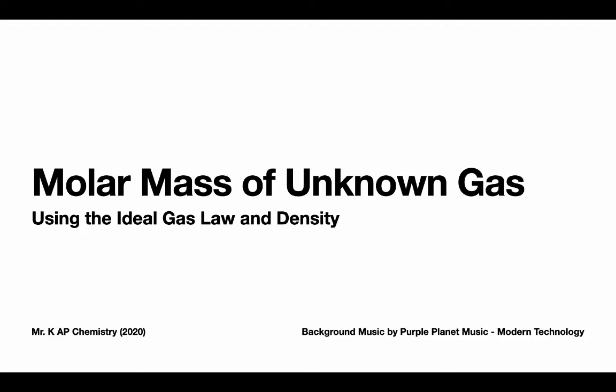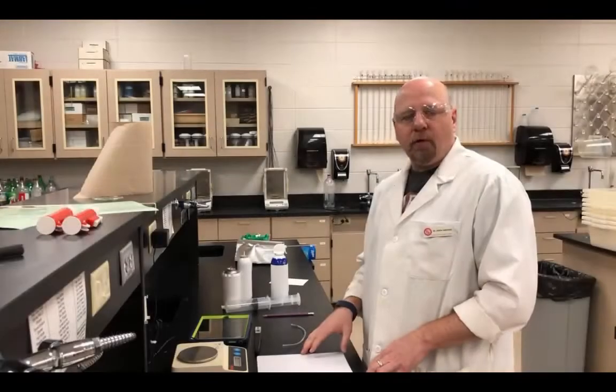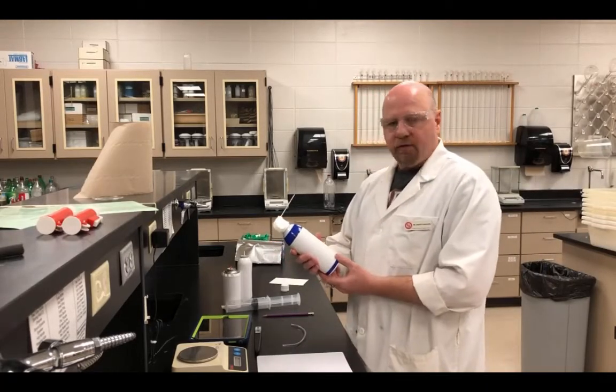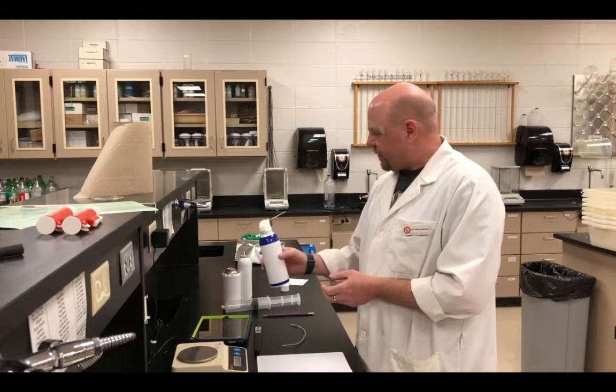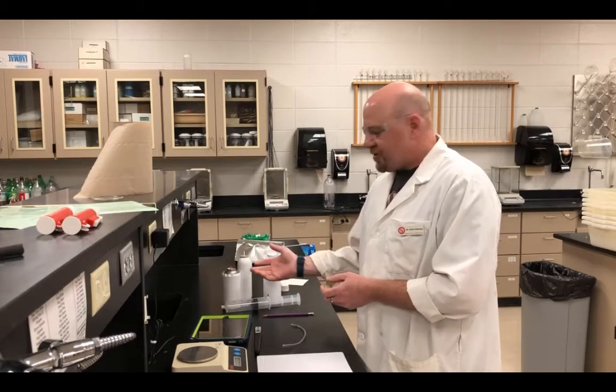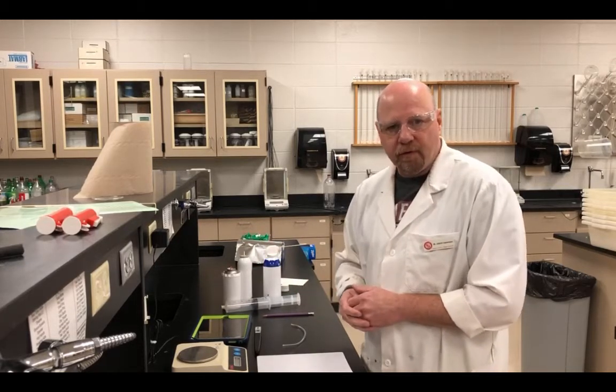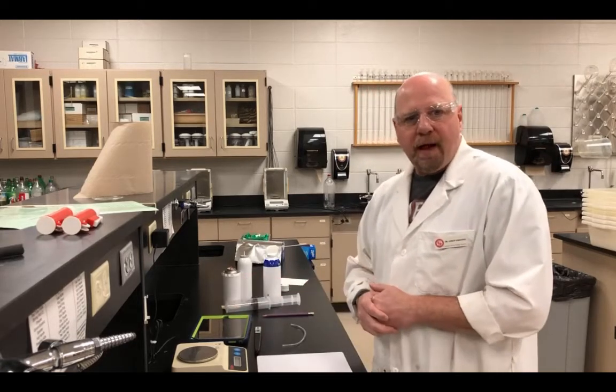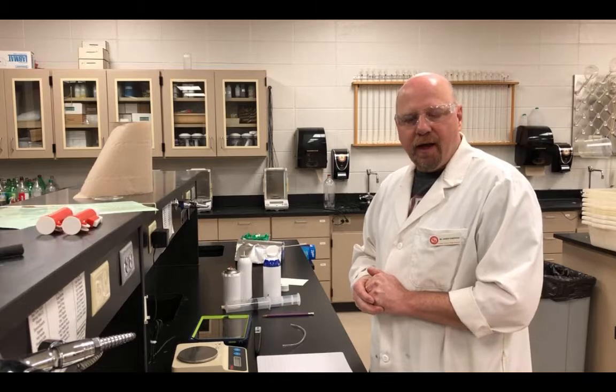So in this video, we're going to look at determining the molar mass of several different gases. I have some unmarked aerosol cans with a gas that's going to be inside of them. Actually, it's a liquid, but it'll turn into a gas when I release them. We're going to collect that, weigh it, and determine the molar mass from the data that we collect.